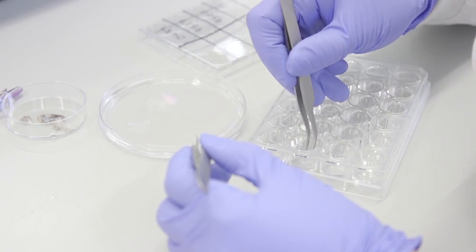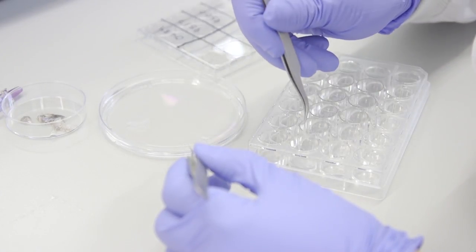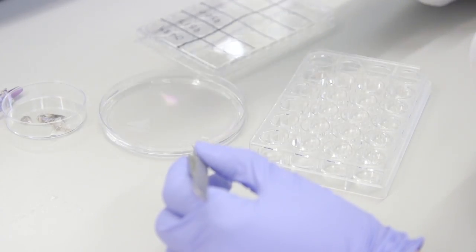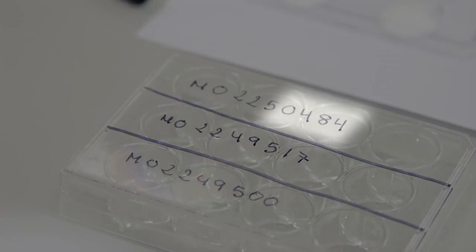Once you have all four epidermal sheets from a sample, transfer these to the 24-well plate, putting two sheets in each well. It is crucial you check that the ID written on the 12-well plate that you took the sample from matches the ID on the 24-well plate that you transfer the sample into.